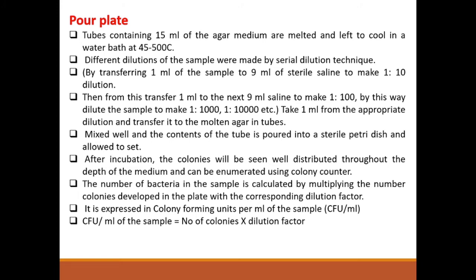Okay. Suppose we counted 150 colonies in the 10 raised to minus 5 dilution. So we can convert it into a colony forming unit, that is CFU. CFU, colony forming unit, is how the number of organisms is expressed: colony forming units per ml of the sample.